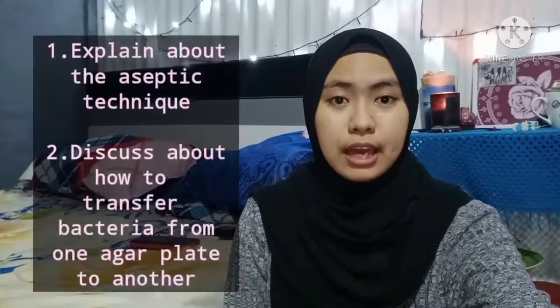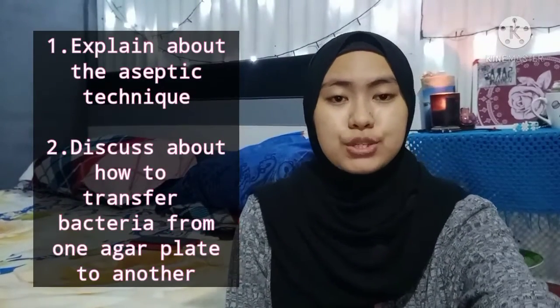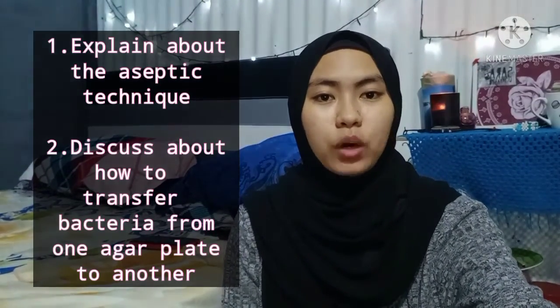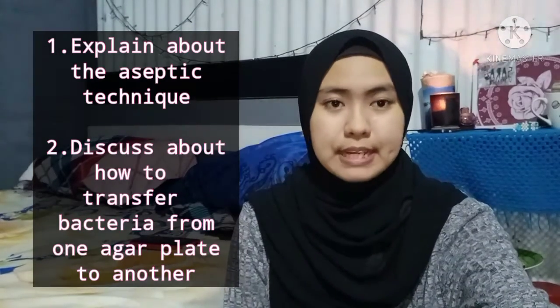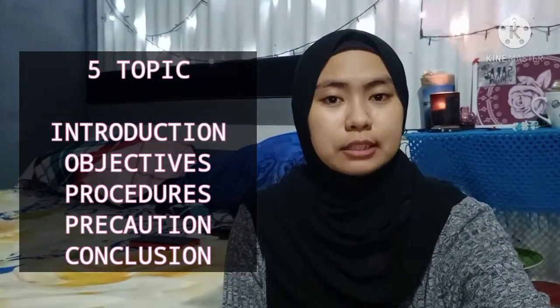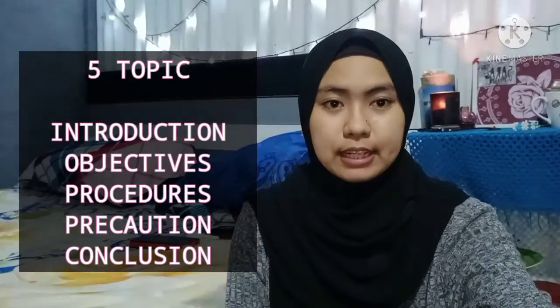In this video, I will present about the aseptic technique in terms of microbiology and, most importantly, explain how to use the proper aseptic technique to transfer bacteria from one agar plate to another agar plate. There are 5 topics that I will discuss. The first is the introduction, where I will talk about the principle of the aseptic technique.